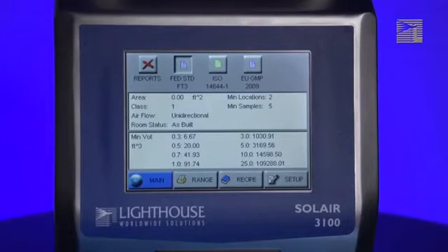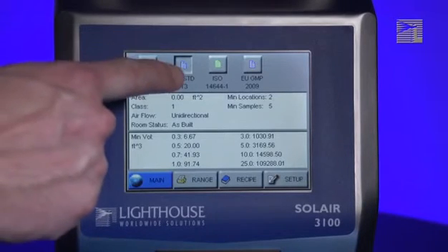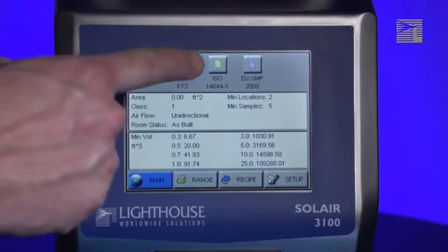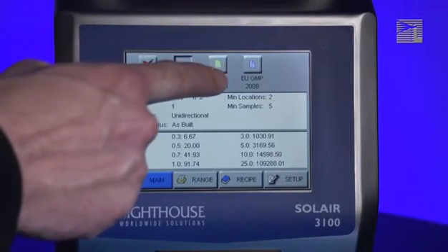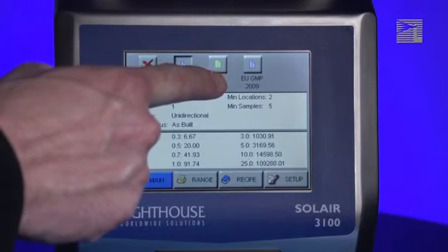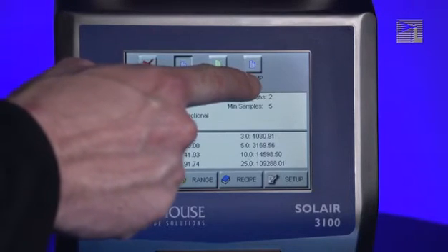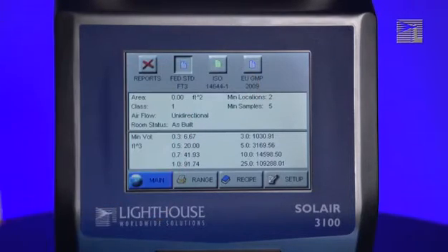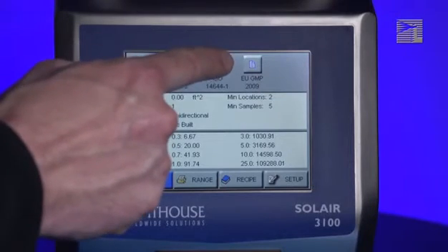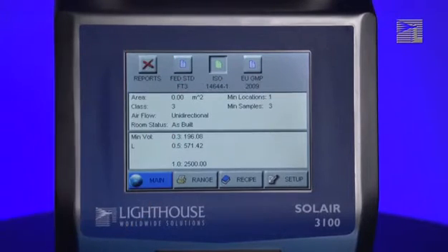There are three types of reports listed at the top of the screen: Federal Standard 209E, ISO 14644-1, and EUGMP. Press the button for the type of report you want to run.